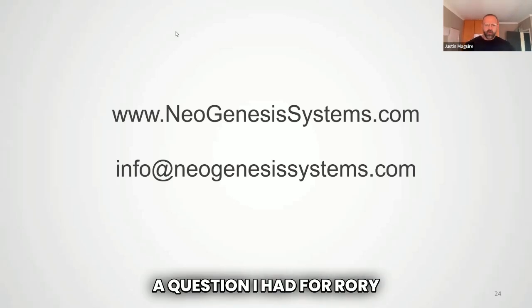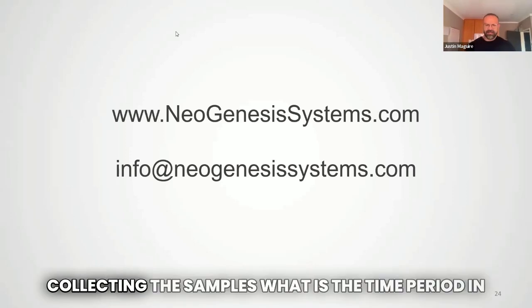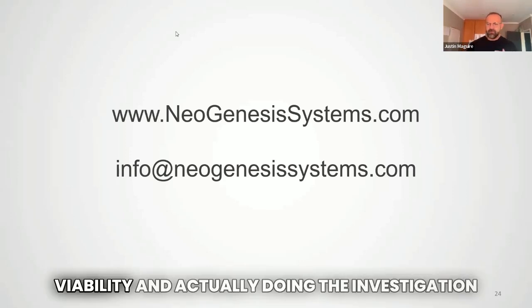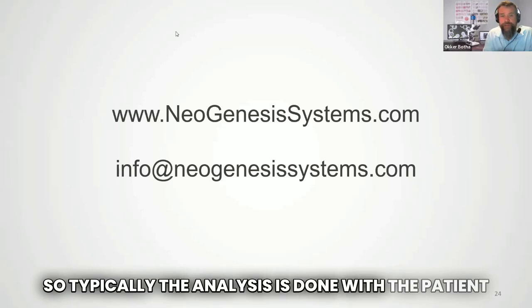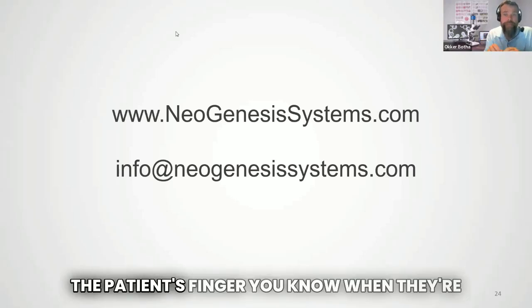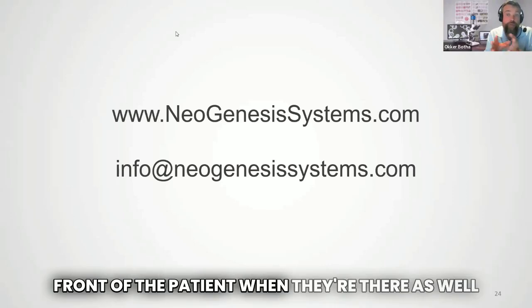A question I had for Rory, I just want to know with you as well. In instances of collecting the samples, what is the time period in terms of transporting the samples across regions for the viability and actually doing the investigation? Well, it's a live test. So typically the analysis is done with the patient in the office, and the sample is taken from the patient's finger when they're there, and analyzed in front of the patient when they're there as well.